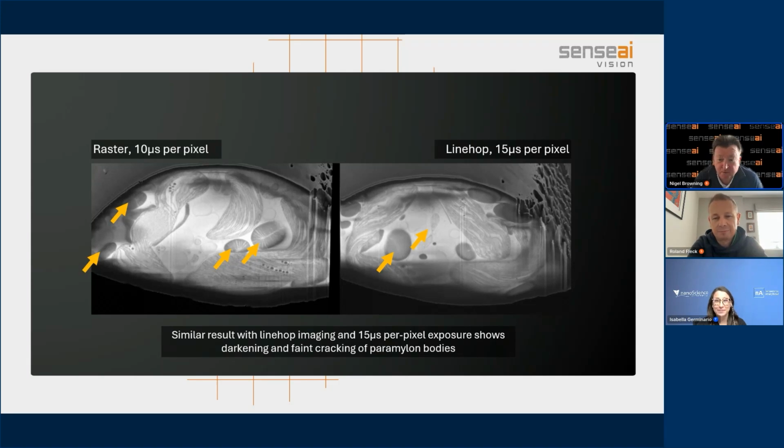So if you're at 25%, it will be 25% of the total electron density that goes into the sample compared to the original one. Now you can start thinking about balancing that dose out in terms of, would you use the same dose that you did for a raster scan for a subsample scan, or would you increase the dose per pixel, but then you have fewer pixels? And so this goes back to the case of how having that extra degree of freedom to go through the system. So if you're only using 25% of the pixels, you might increase the electron dose in each pixel because the integrated density going into the whole sample is going to be lower.